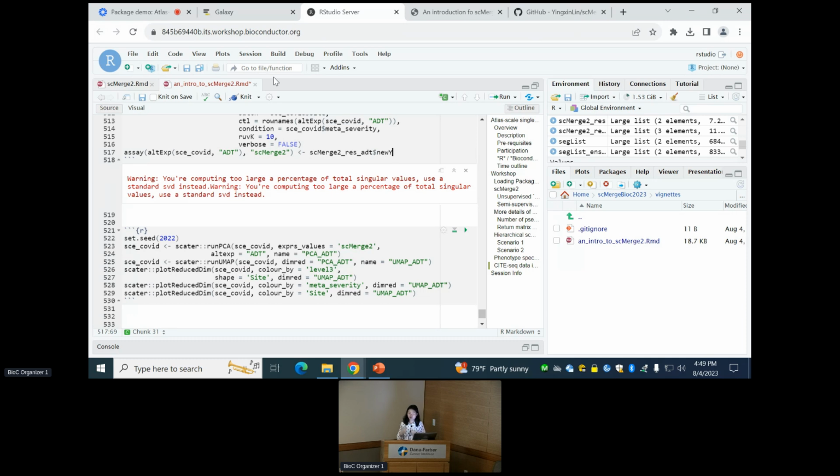You can also look at certain cell type markers, but then you need to actually know the cluster is, say, CD8 T cells. Then I go to the CD8 T cells and see whether this marker gene expression is still higher, whether CD8A is higher than in the other cell types. So for scMerge, I would recommend looking at the gene expression to check the level of the adjustment.